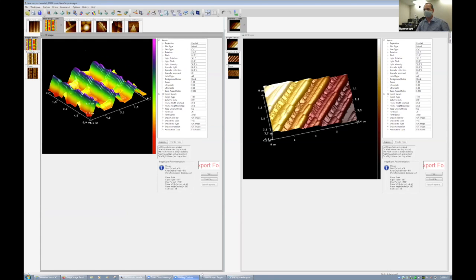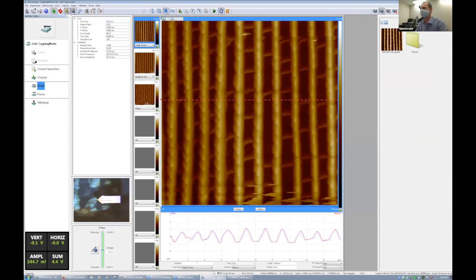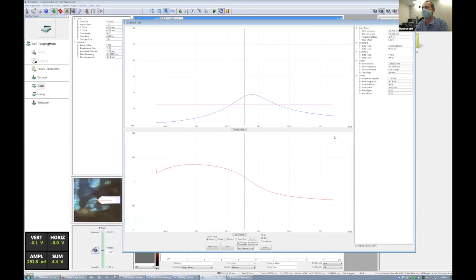So is the silicon one of the materials used as a vehicle, like in yesterday's talk? So silicon, in this particular case, is being used as a tool, not necessarily a vehicle. Yesterday in Cody's talk, Cody used silicon as a substrate, and then the nanoparticles were the vehicle that held the palladium atoms.